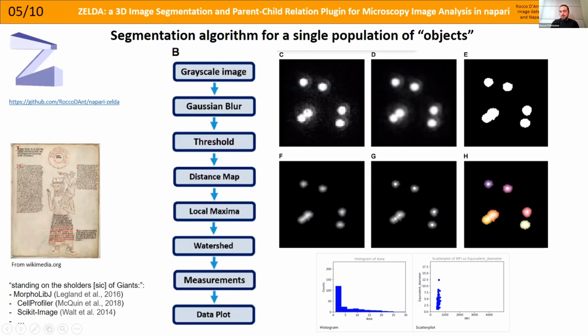So the different steps of this workflow are run through the use of the scikit-image library, but they are done entirely graphically inside the Napari viewer. In the end, it is possible to export the measurements and produce some plots with matplotlib.